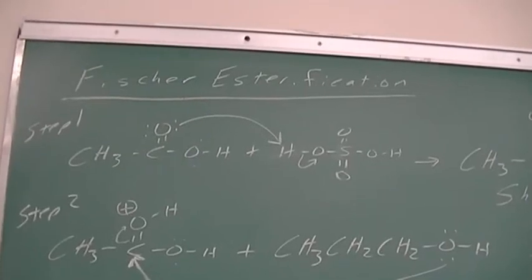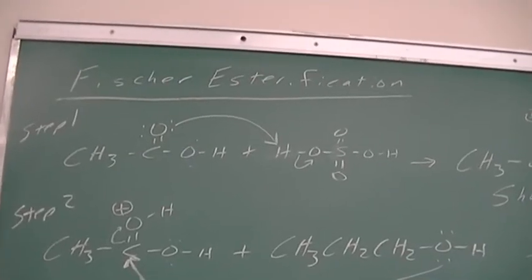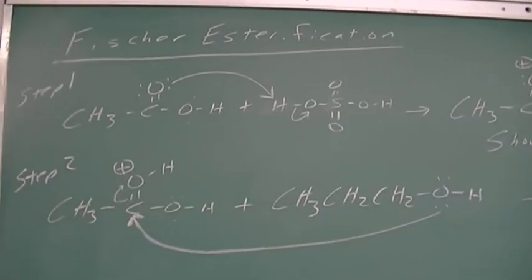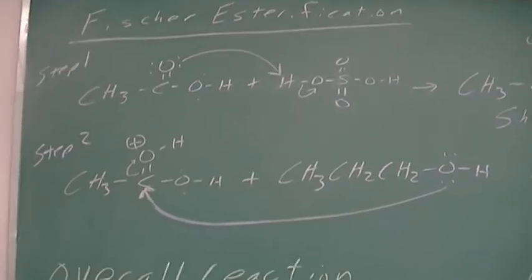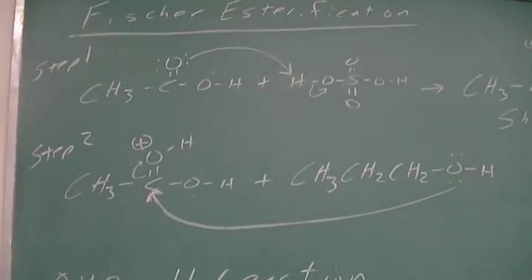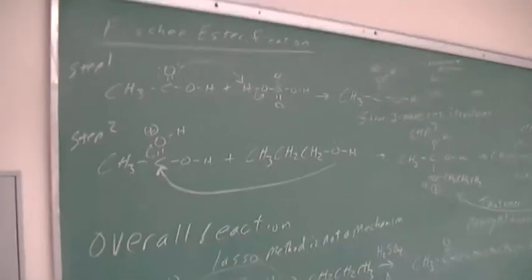Alright, in this experiment we're going to do the Fischer Esterification. I have the reaction mechanism on the board. Again, I don't have it the way you need to have it in your lab book. You have to have all of your steps balanced.